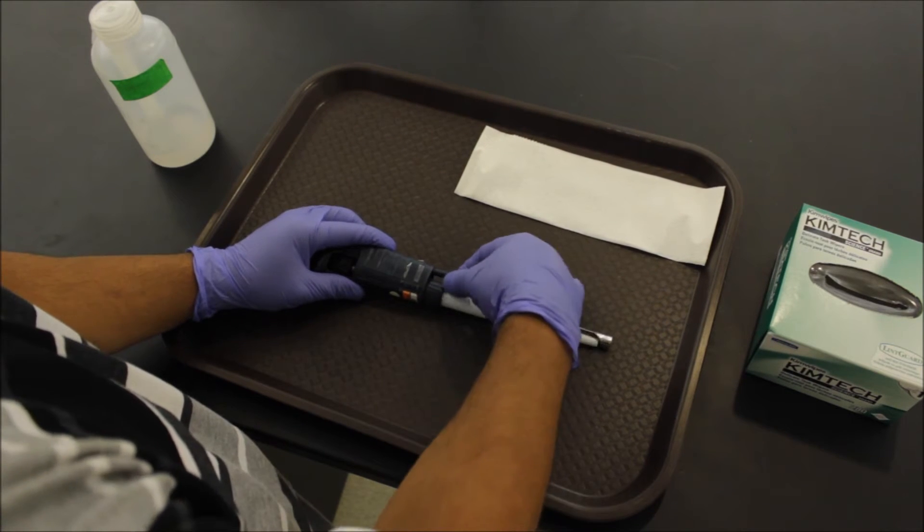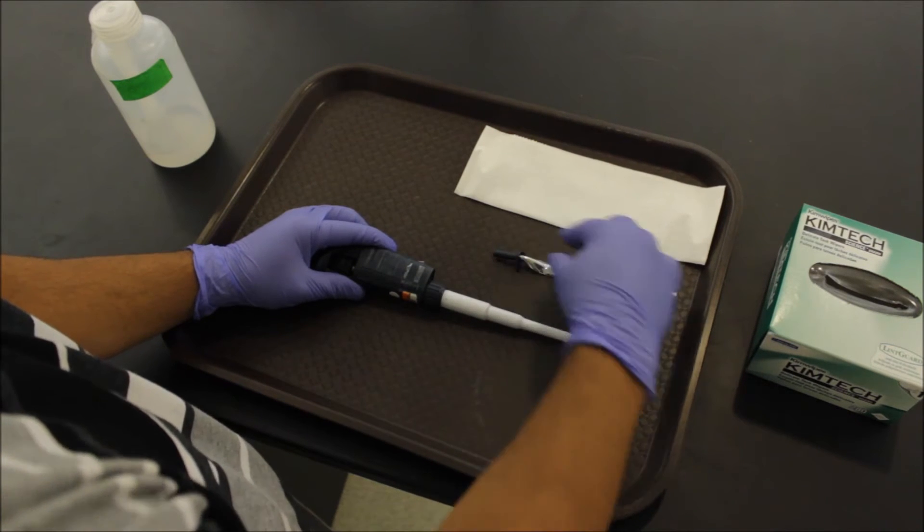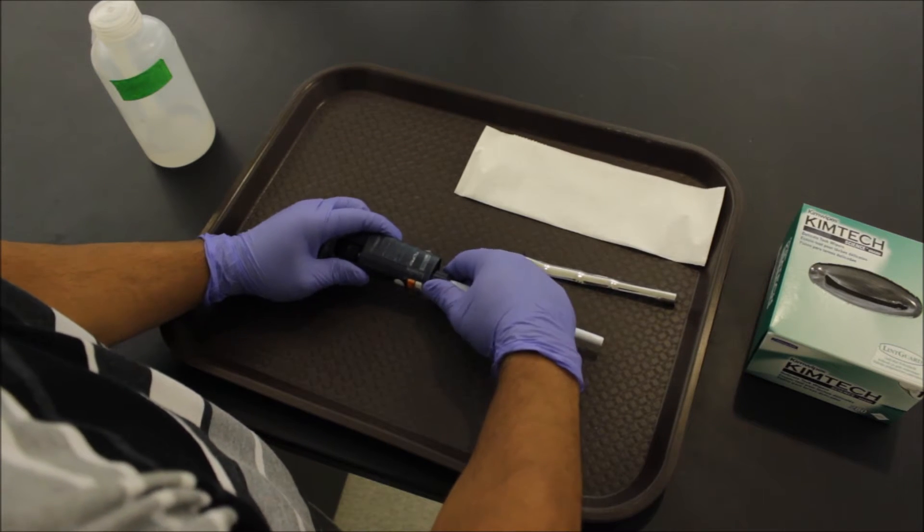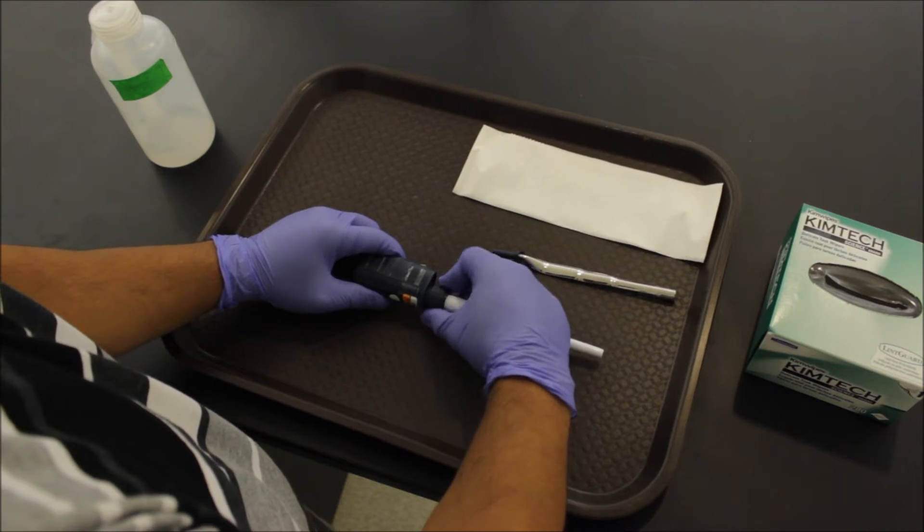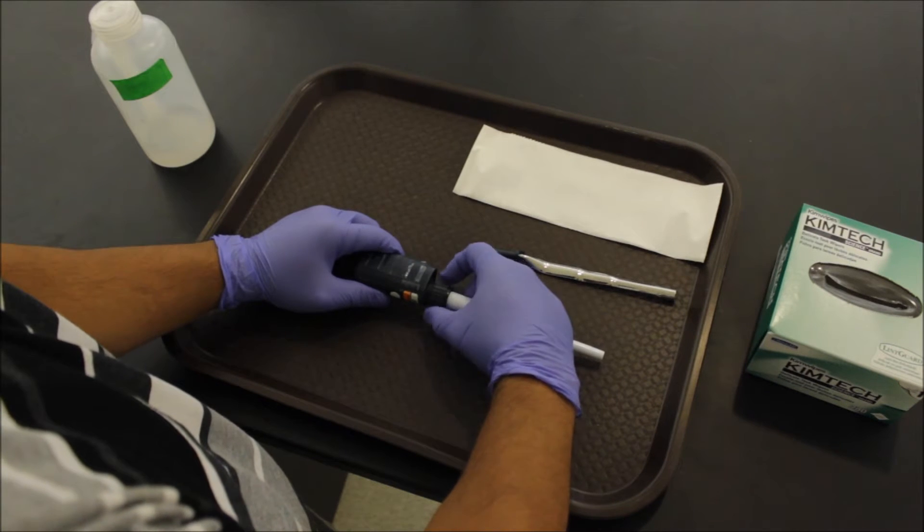So first off, you've got to come over here and take off your ejector. Set that to the side. Come grab this nut securing the barrel. Slowly twist that off, but watch for the spring which will pop.